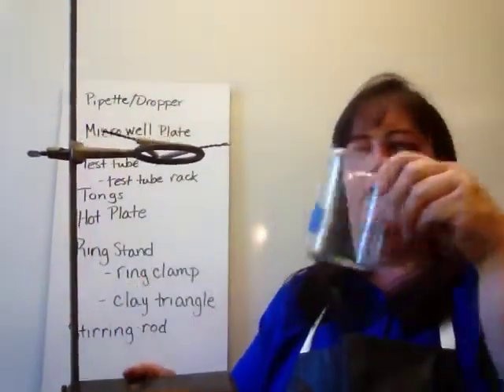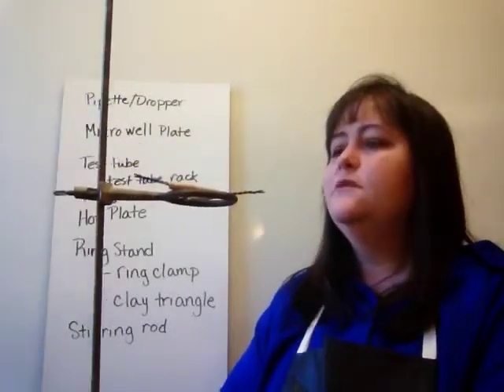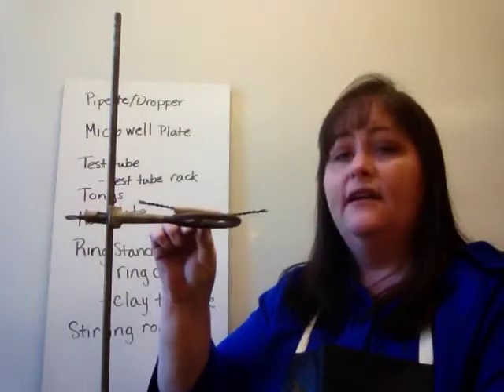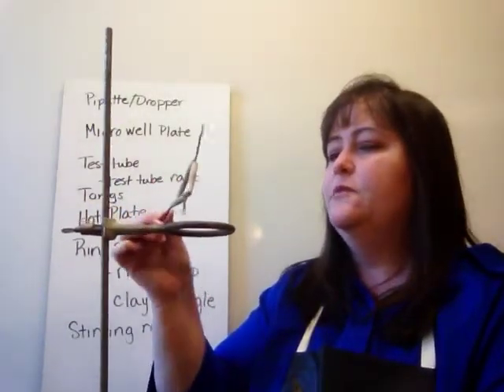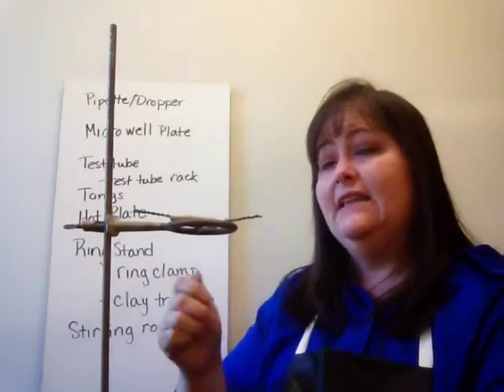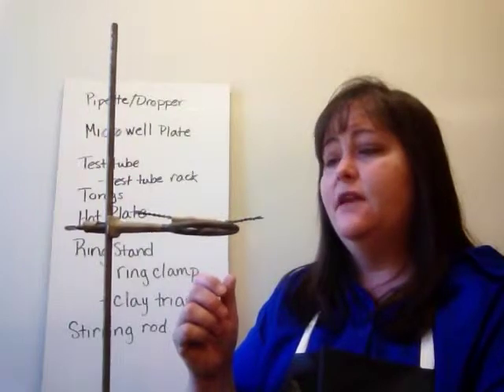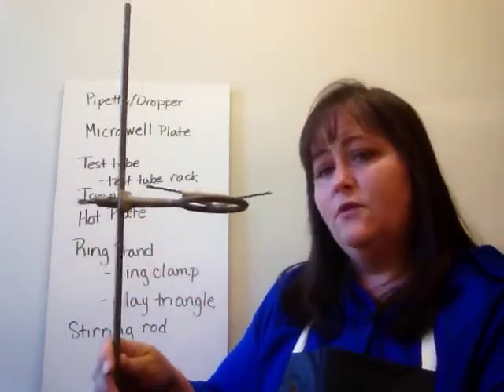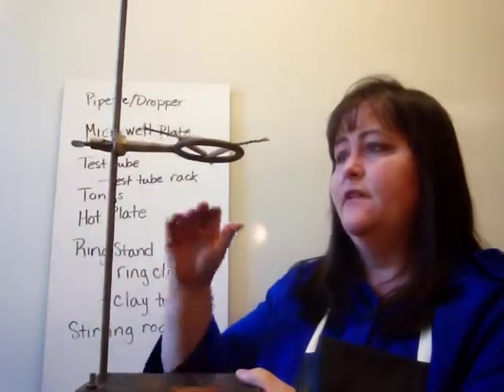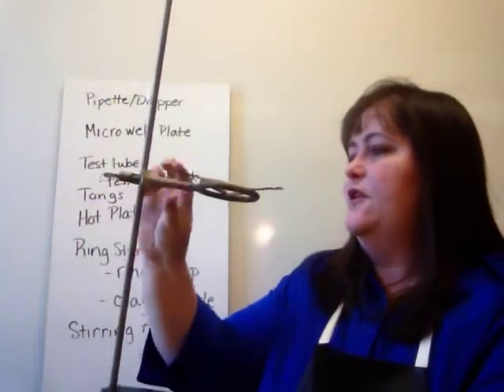And then you have a clay triangle at the top, and the clay triangle is usually used to hold something called a crucible. A crucible might remind you of a pharmacy sign, but it's not the same thing, but it might remind you of that. But a crucible sits in here, and then we can heat it with a flame, and sometimes that causes a reaction, and sometimes that just dries out a chemical. But this is what the ring stand is for, heating items above a Bunsen burner or flame. And this is called the ring clamp.